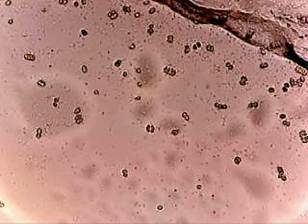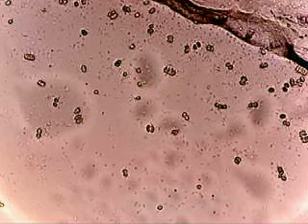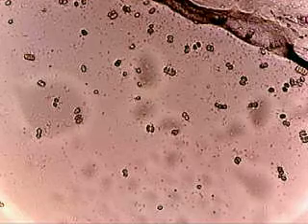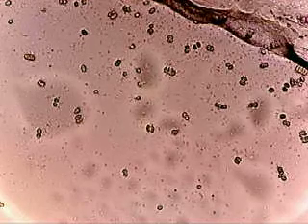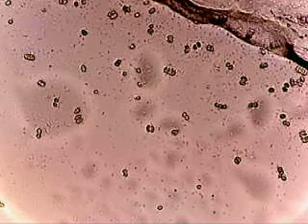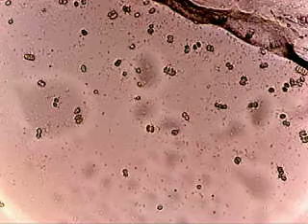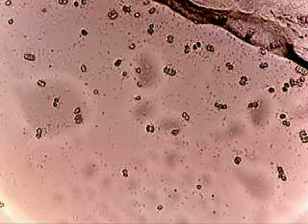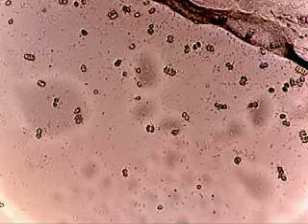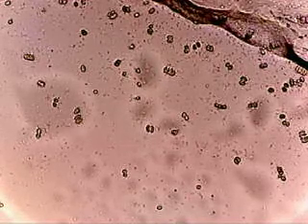At first glance here, without being too particular, you should notice immediately two types of objects, in a very basic sense. One, moving bacilli or spirilli. I'm not sure which at this level. I'm going to assume spirilli because they're the most dominant bacteria on this slide. And then, of course, the other type is a blue-green algae that I've been studying. It came from a fountain water sample at work.